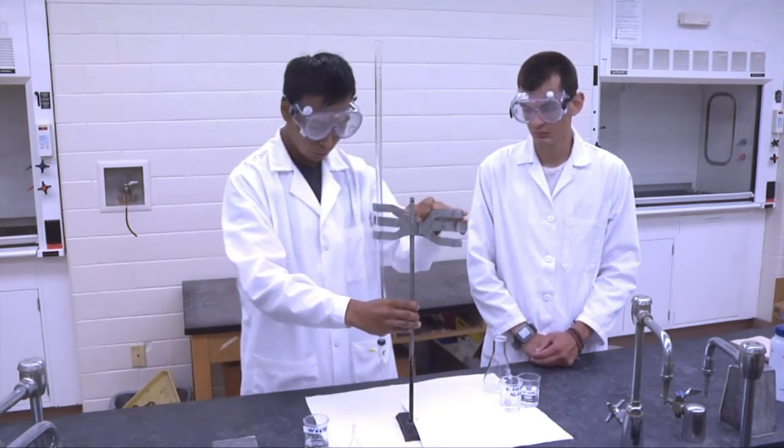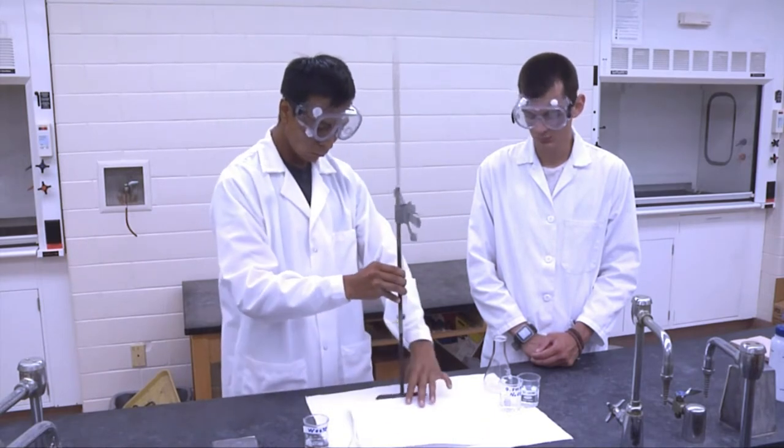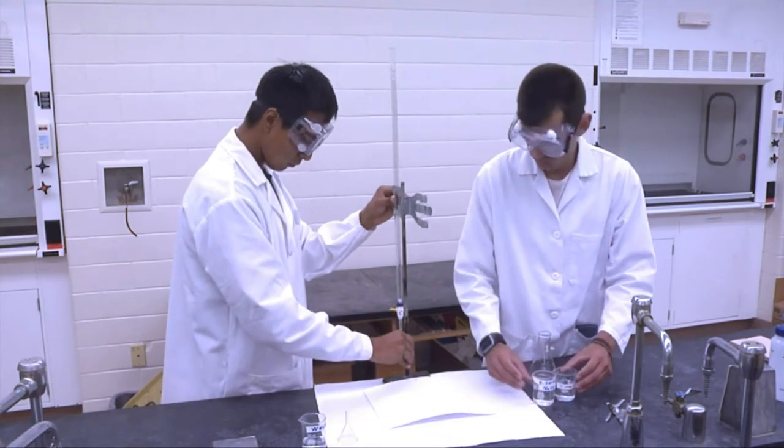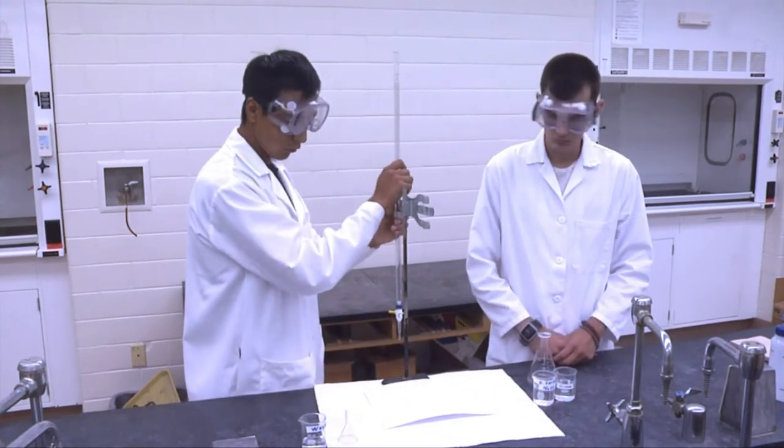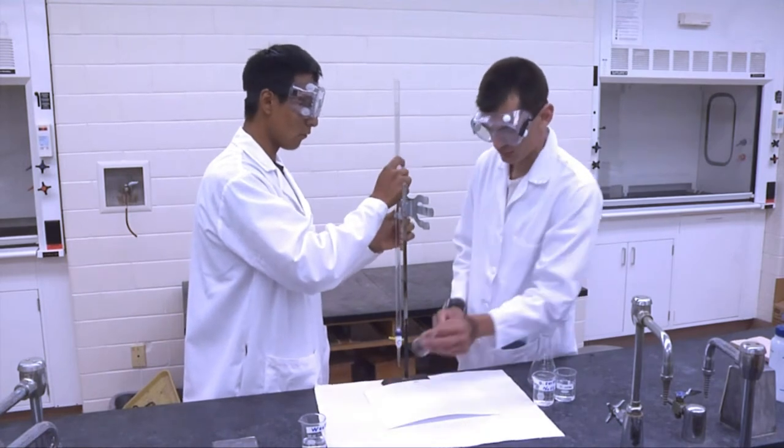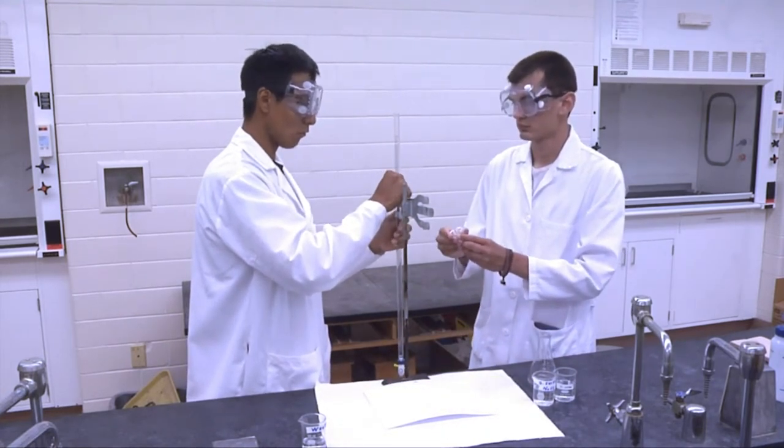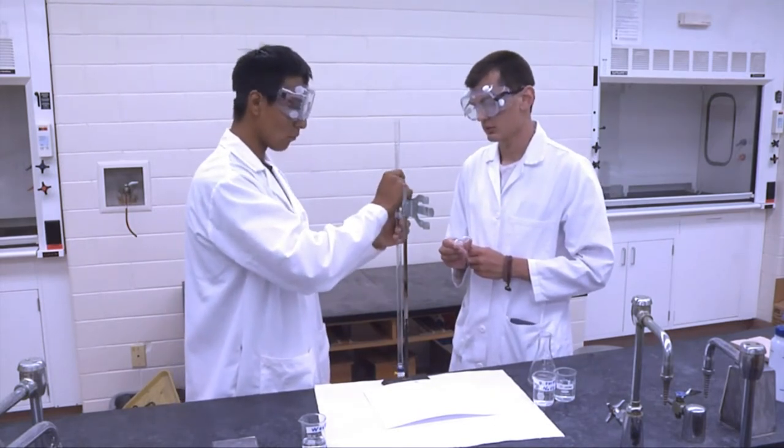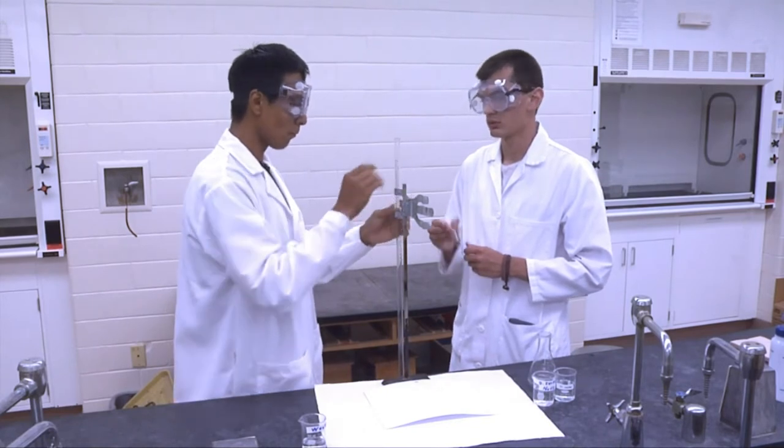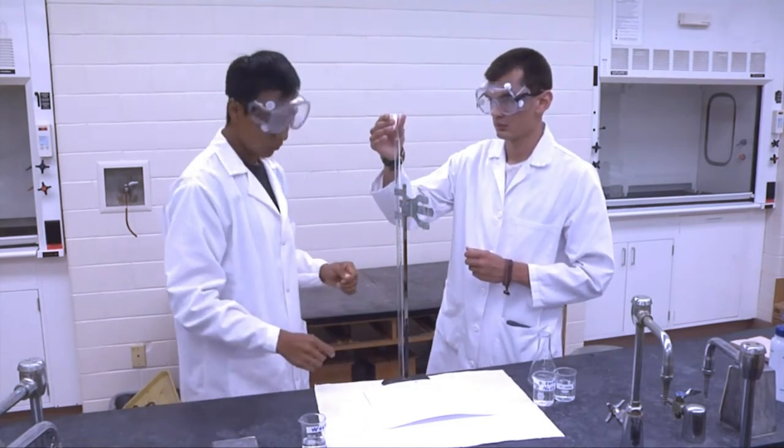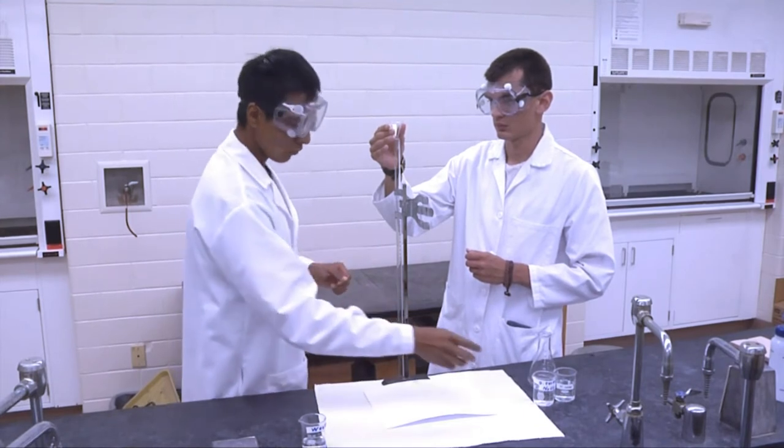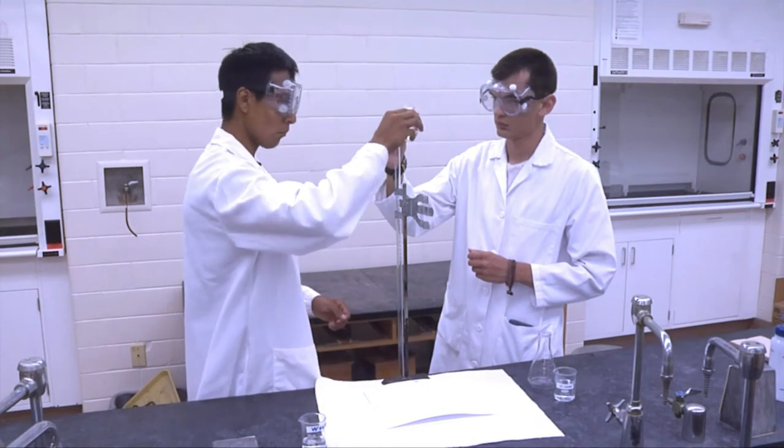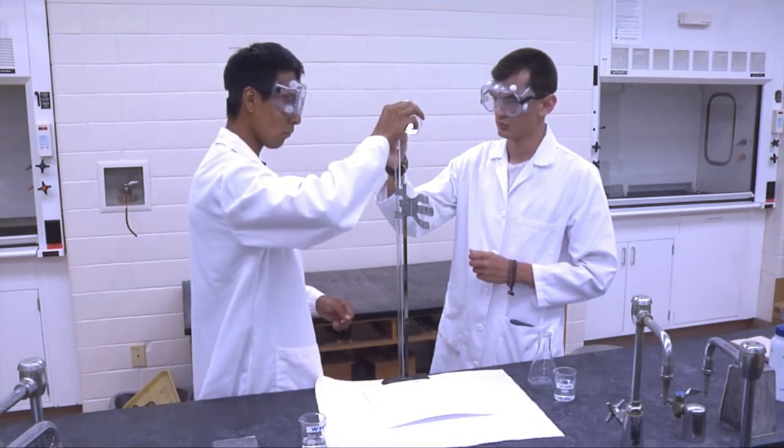With the burette properly rinsed, it can be filled. To prevent spills and splashes, make sure the stopcock is closed, a funnel is used, and the burette is adjusted to an appropriate height. Take special care not to overfill the burette, and remove the funnel when done.